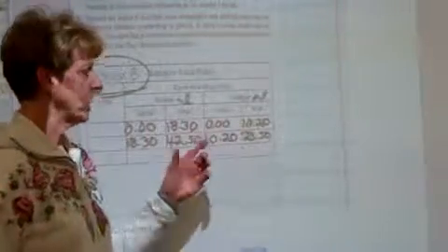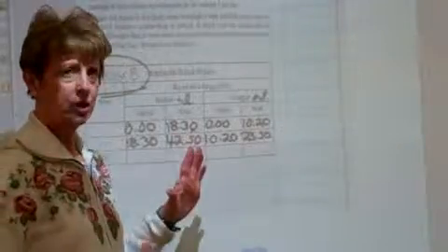Okay, what's calculation 1? So here's the list of all these calculations. Let's just do them. Just get your numbers in our sample calculation table, showing your work for just a few items. I'll show you which ones.